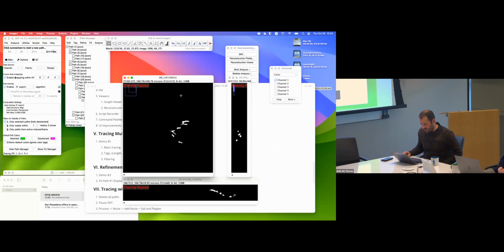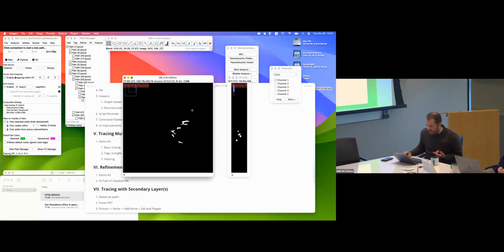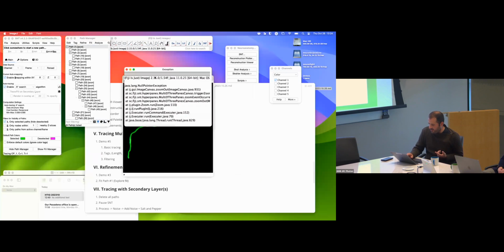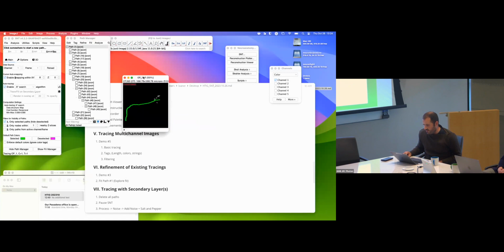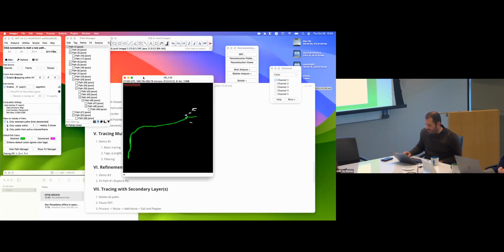So going back to our to-do list, one thing that SNT is pretty cool to use for, I just got an exception, 2 exceptions. This never happens.